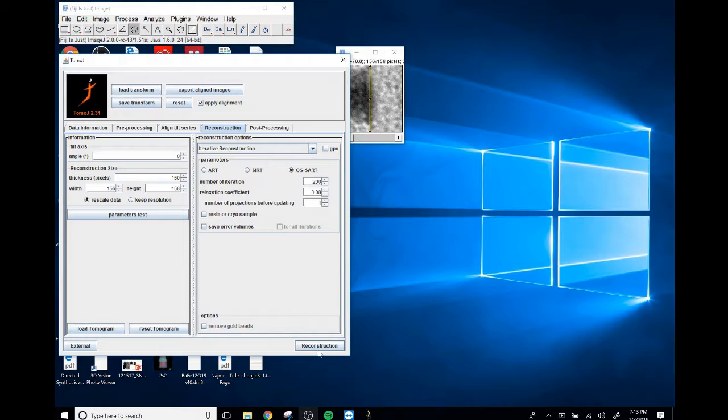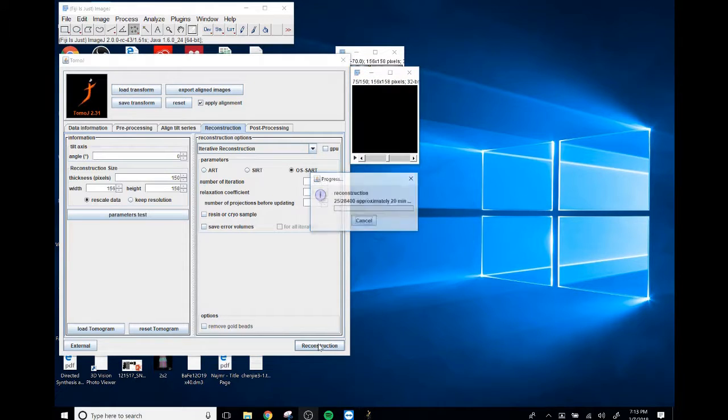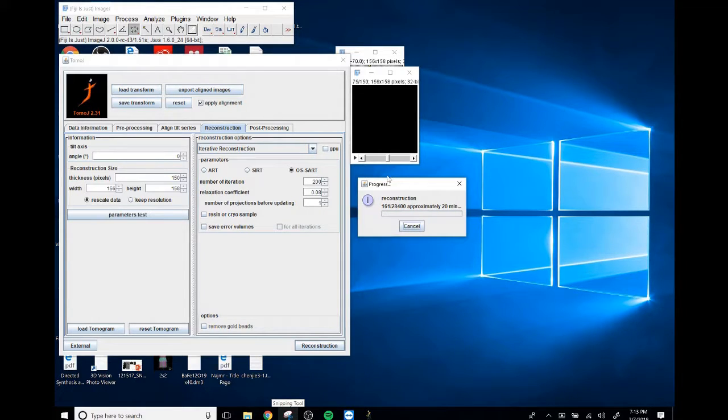All right. Reconstruction. See, 20 minutes, not bad. So I think the maximum you can do is a 1,000. So I'm actually fine with hitting a fifth of that max. Maybe I'll do an overnight run or something later. But we'll get back to you guys. I'll stop recording now so I can go ahead and work on my computer a bit. But I'll be back in 20 minutes and show you guys what the results.